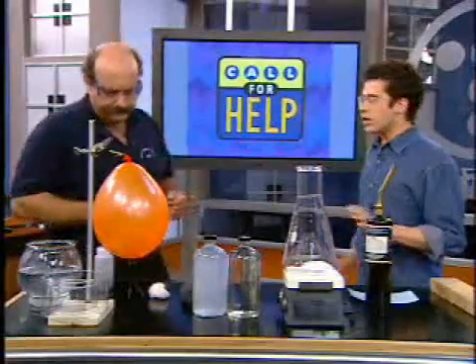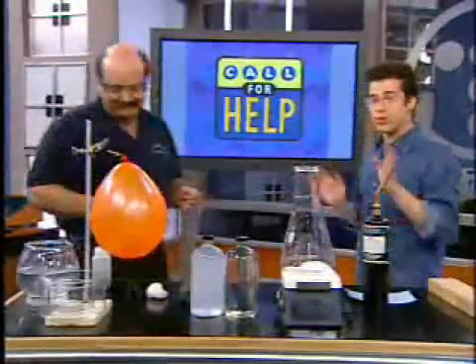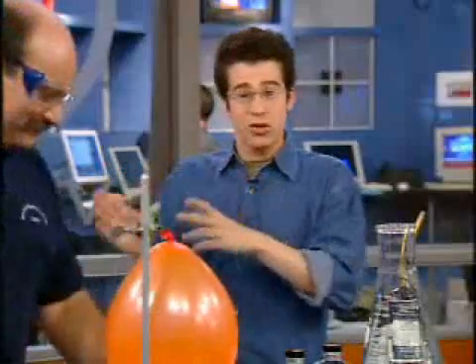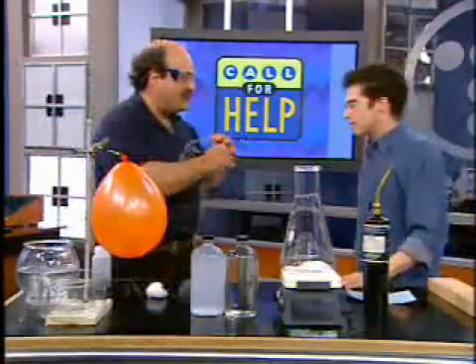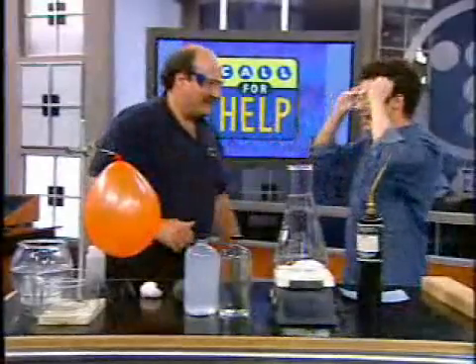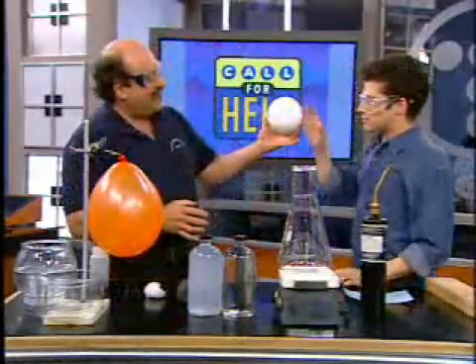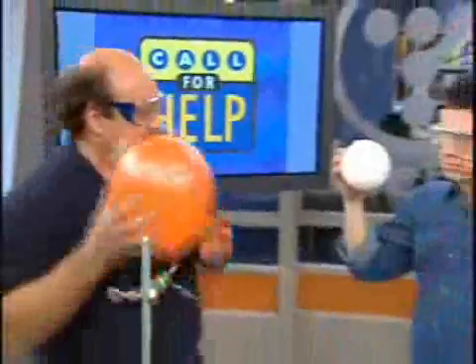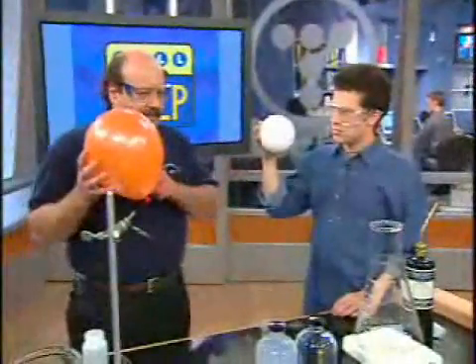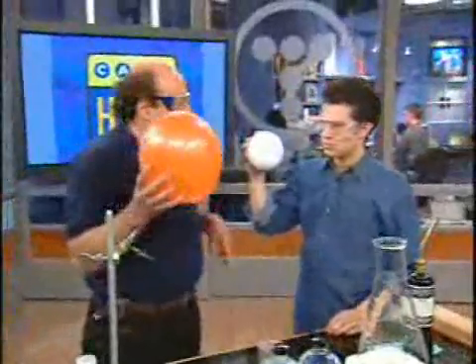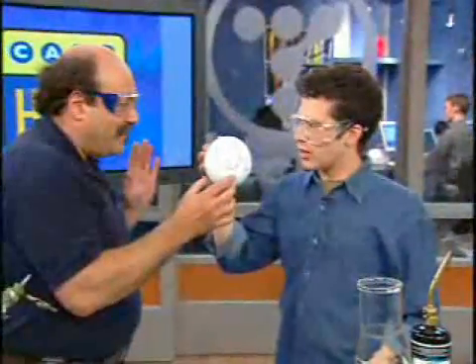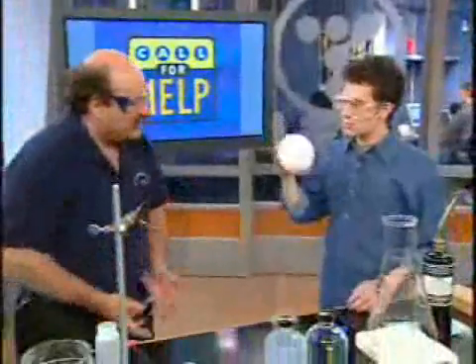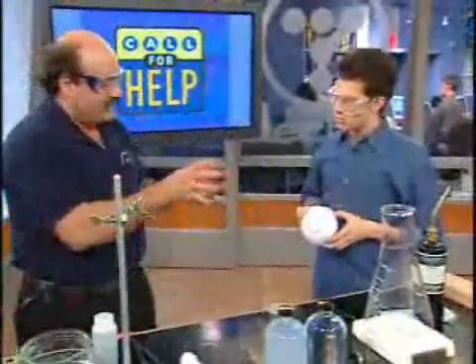I've got to say before we get going here, Rick is obviously a professional, so don't try this at home. That's why he's got the little doctor in front of his name, because he knows what he's doing. Now Chris, I would like you, as my associate chemist here, to please put on some goggles. You know what grade I got in chemistry, didn't you? That's why I want you to have the goggles on. Let's pretend, for example, that you're an oxygen atom. You be the oxygen atom. And what we're going to have here is an ammonium — we've got ammonia here. These two really want to react, but they're not going to react when one's here and one's here. They're only going to react when one gets closer to the other. It's filled with electron density. It's going to react when it gets close. So what we want to do is increase the rate that oxygen is going to react with something else.